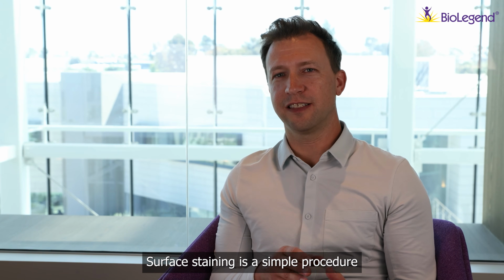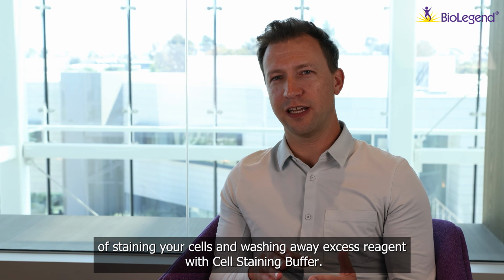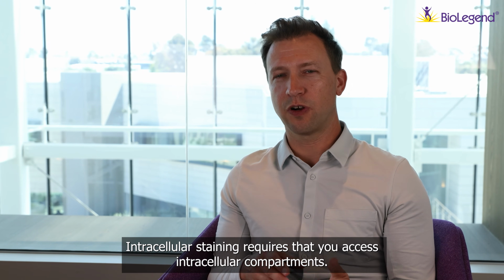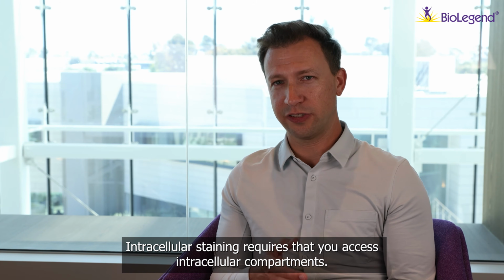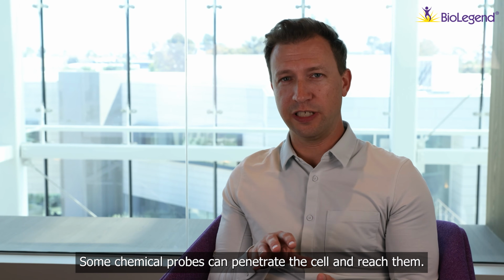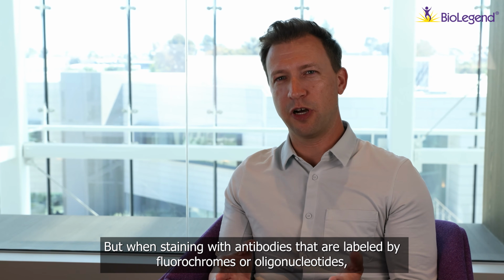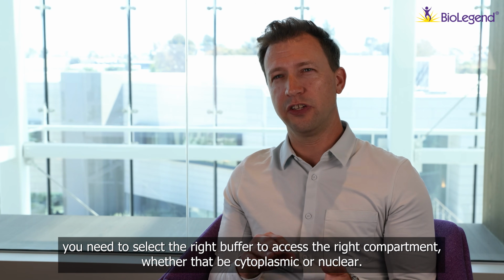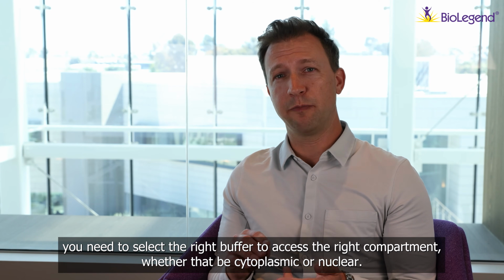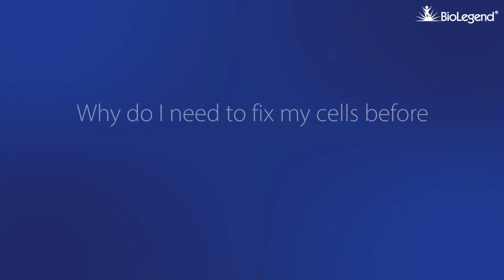Surface staining is a simple procedure of staining your cells, then washing away excess reagent with cell staining buffer. Intracellular staining requires that you access intracellular compartments. Some chemical probes can penetrate the cell and reach those, but when staining with antibodies that are labeled by fluorochromes or oligonucleotides, you need to select the right buffer to access the right compartment, whether that be cytoplasmic or nuclear.